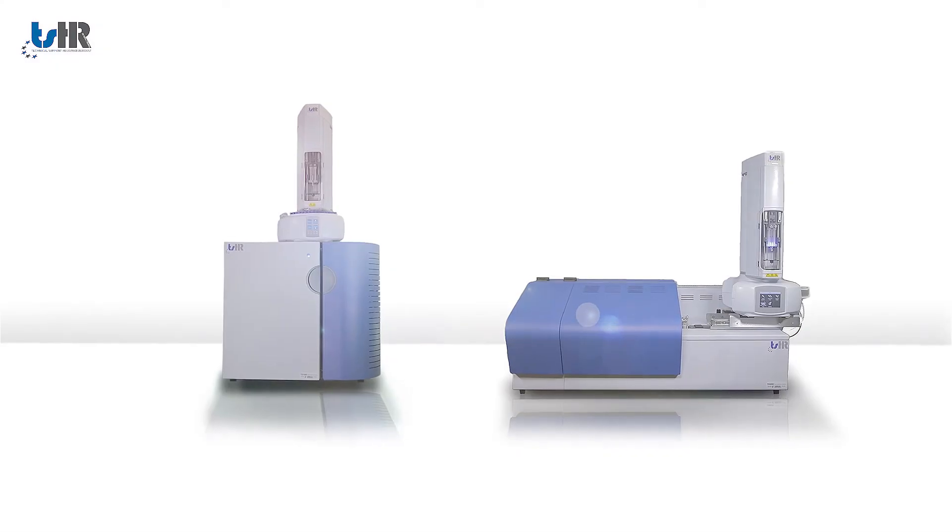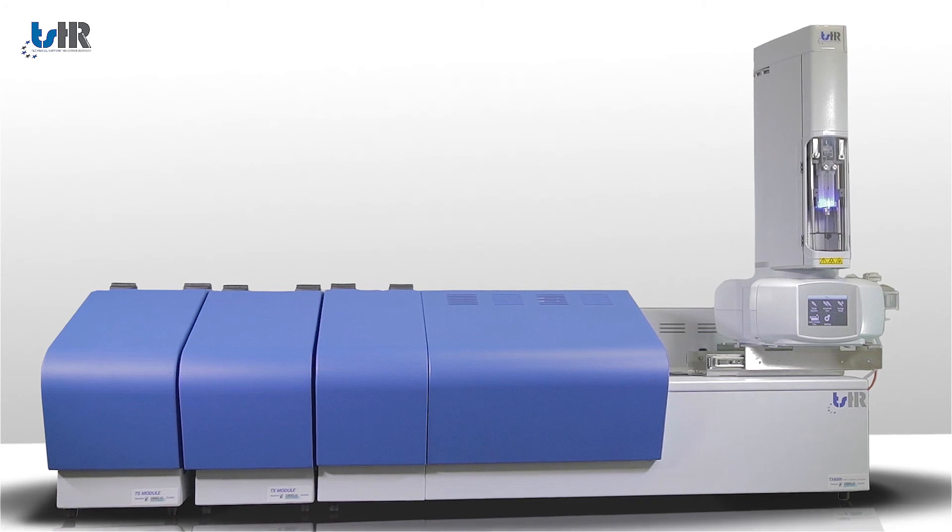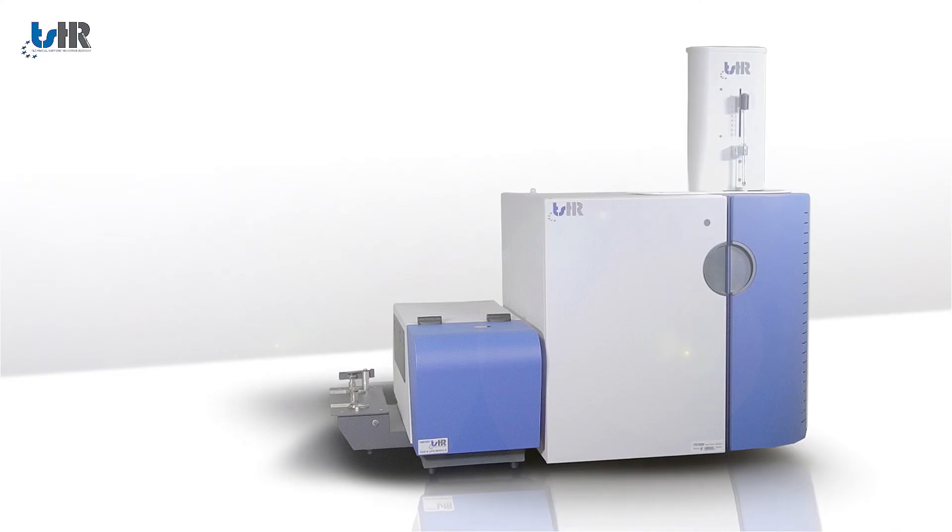Both instrument platforms can be equipped with various liquid auto sampler configurations to support both small and high throughput labs and a module for reliable analysis of gaseous and liquefied petroleum gas samples.